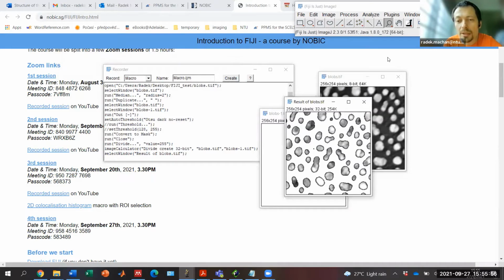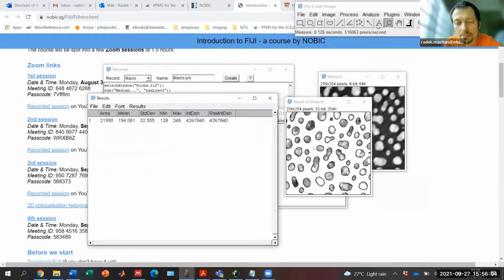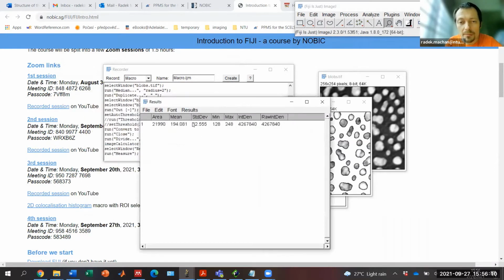Then what I do, I will analyze, measure. And I have the result here.